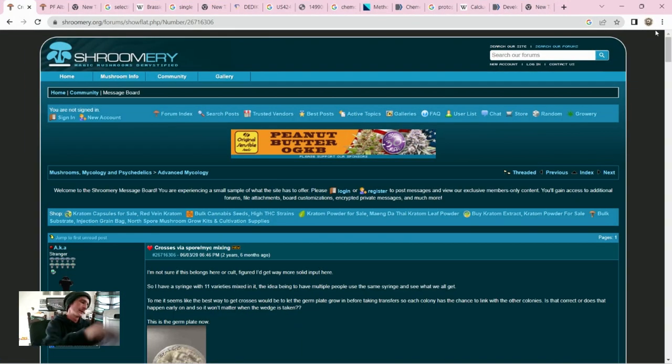Now, I went over some biological and taxonomic information, went over the life cycle of the mushroom, and what it means to go from spore to spore genetically. So if we were going to talk about breeding techniques and people breeding mushrooms, most mushrooms have been bred by mixing spores together simply. You can do that by taking some spores from one print as well as another and putting those onto the same plate for an inoculation, and through the genetic exchanges of what we just described, it will occur.